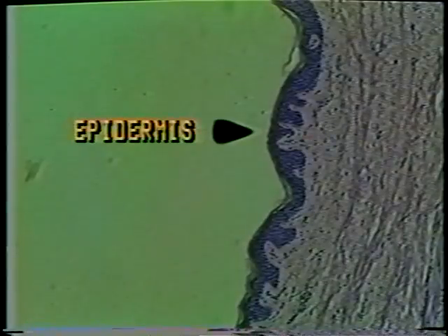Now, let us take a look at a microscopic slide of Caucasian skin using the 10x objective. Note that the epidermis is composed of stratified squamous epithelium, which functions as a tough barrier to microbes and chemicals. This layer has often been further subdivided.